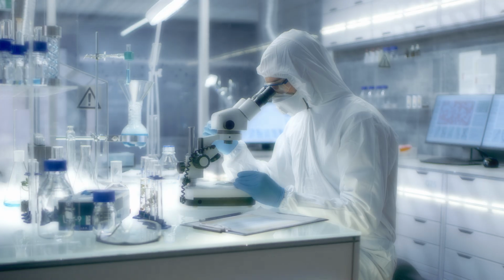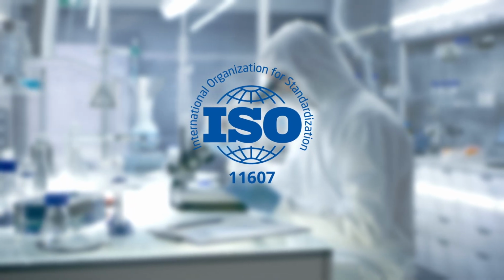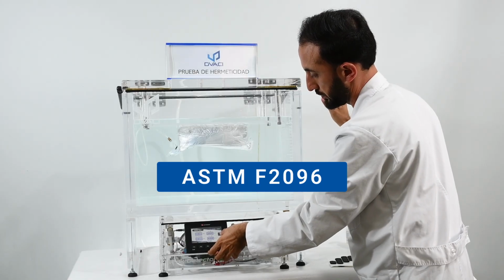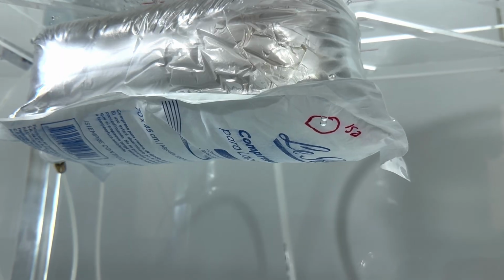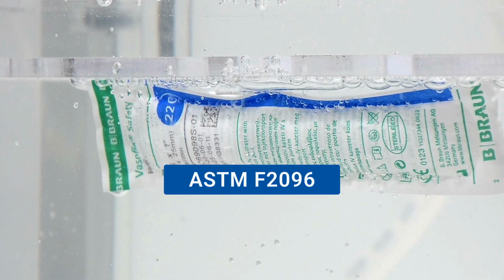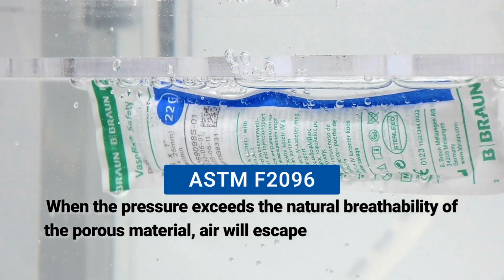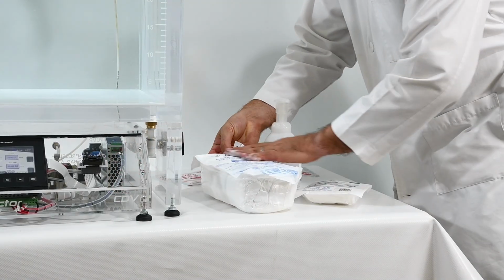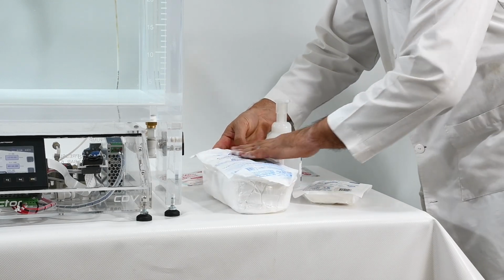Several pharmaceutical standards, like ISO 11607, recommend using the ASTM F2096 test protocol, which uses the internal pressurization immersion technique, also known as the bubble test. F2096 is clear: when the pressure exceeds the natural breathability of the porous material, air will escape and look like a leak. The solution? It's in the same standard: apply a blocking agent to seal the Tyvek.